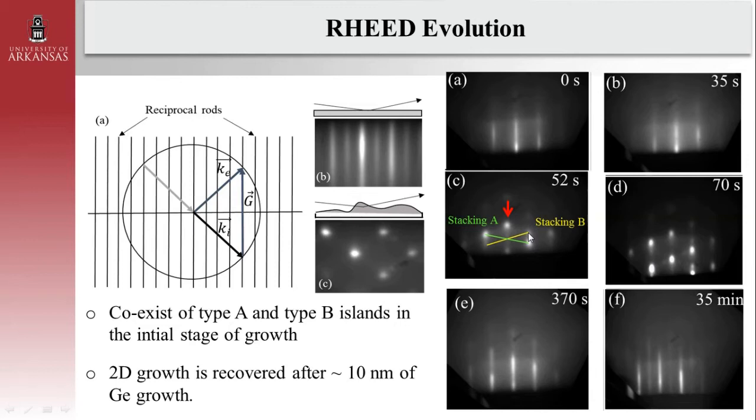If you look carefully, one of the patterns has a significantly lower intensity. If you consider this as a mirror plane, they can be made to coincide with each other. Basically, if one of them is mirrored about the central rod, you can flip this here and have the mirror image here.